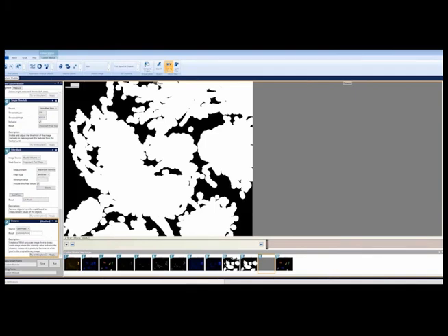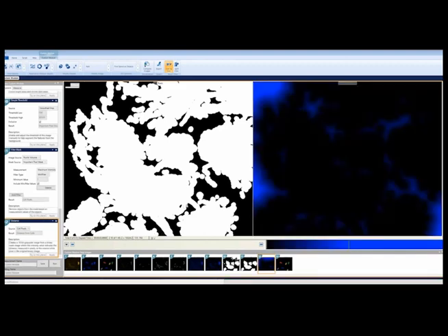The intensity peaks will come from the distance map, an image where we will take each pixel's intensity as a measure of the distance from the edge of the object. We'll use it in the cell pixels mask to get the intensity peaks we need.